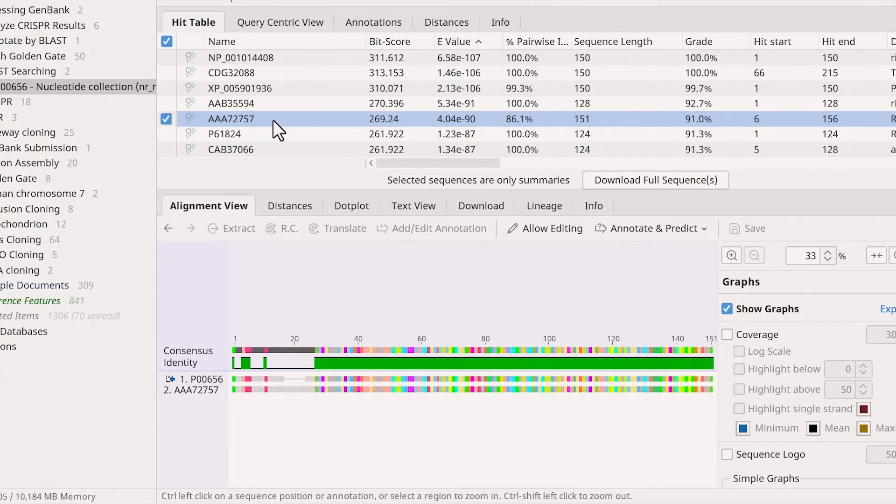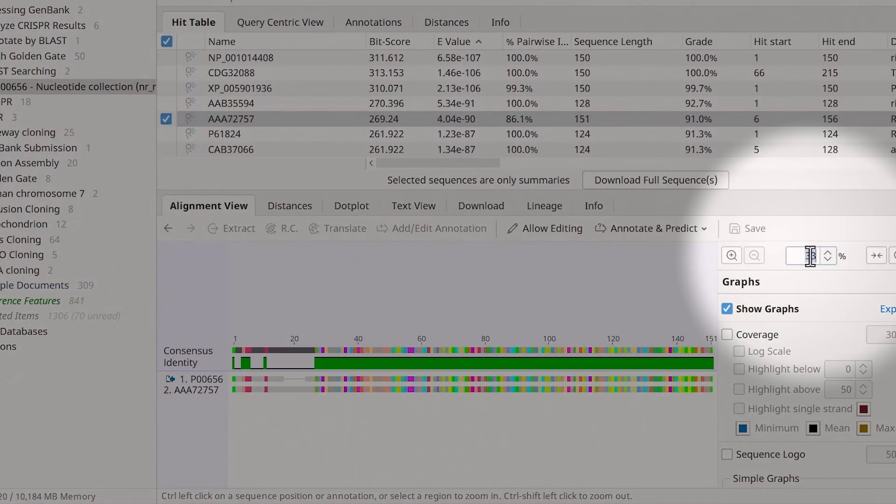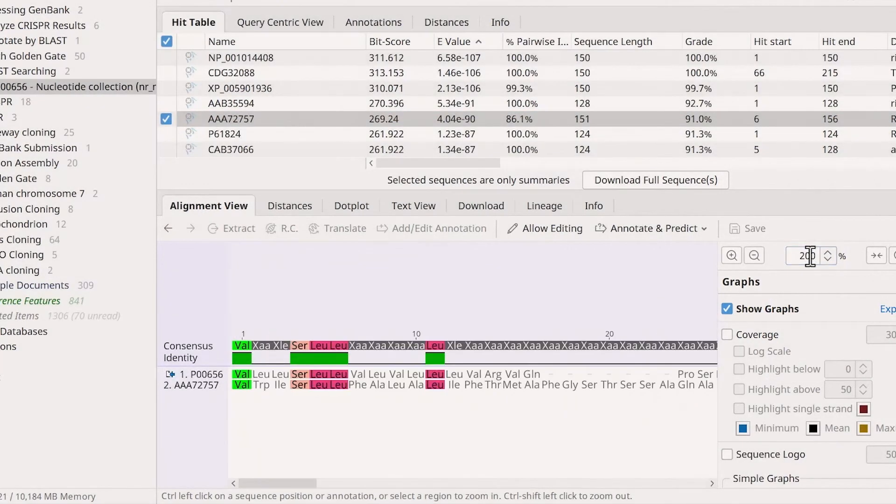To look at the sequence comparison in more detail, you can use the zoom tools to focus on different regions. Now you can see the individual codons or bases and how they differ.